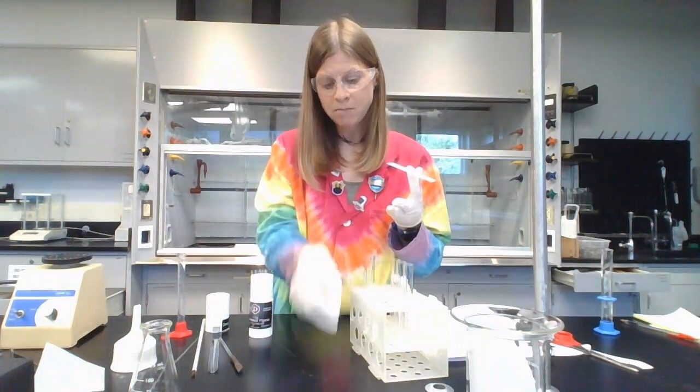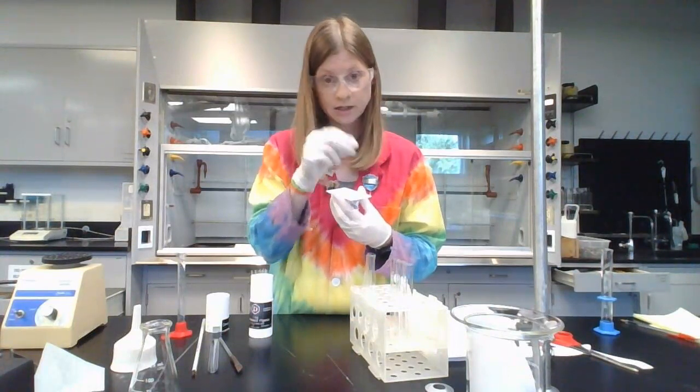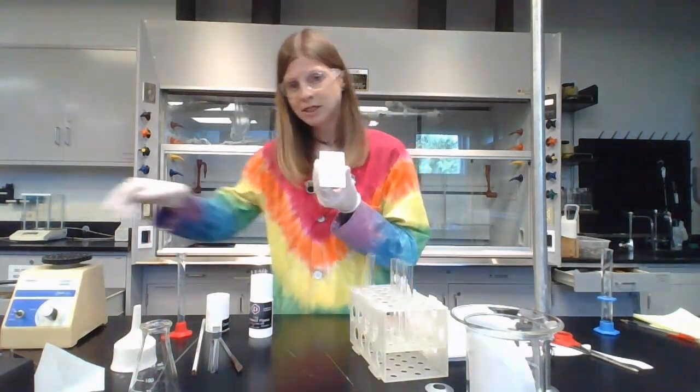Once you're done with that micropipette, you're going to get a second one. Now do it for the aspirin, dot, dot, dot. Now do it for your product, dot, dot, dot. So you've got 3 spots. Now you will not be able to see the spots at all.